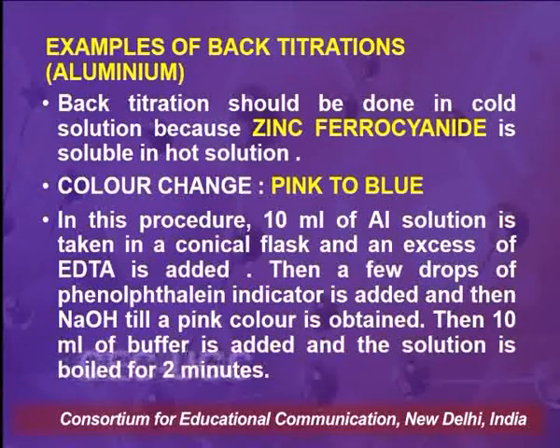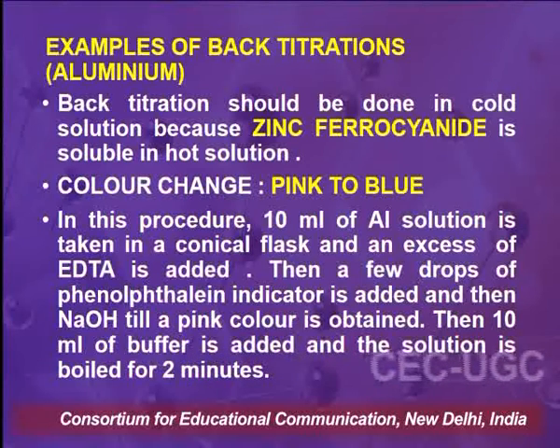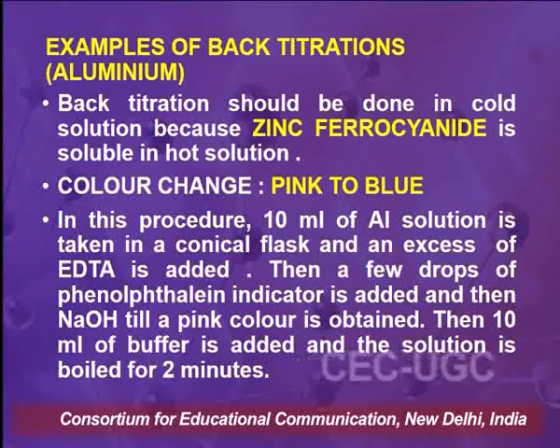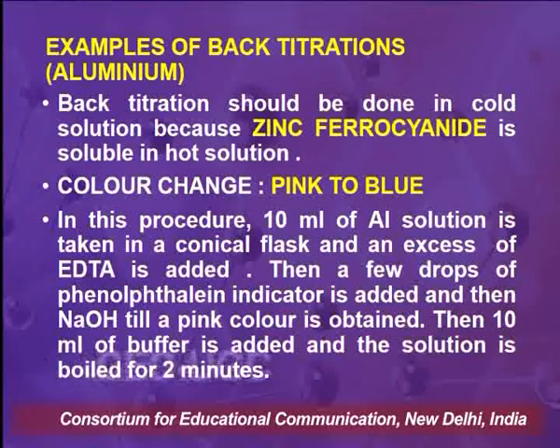Back titration should be done in cold solution because zinc ferrocyanide is soluble in hot solution. As we remember that ferrocyanide is being used as the indicator, so zinc, which is used in the burette, can form the zinc ferrocyanide complex, which will be soluble in hot solution. So, therefore, this titration of aluminium EDTA complex with zinc needs to be performed in cold, and the color change during this titration is pink to blue towards the end point.